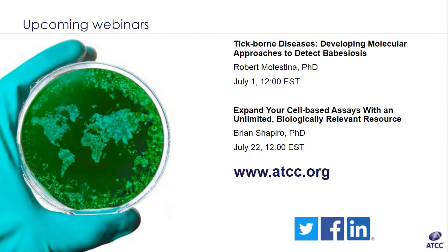There are going to be variations in extraction efficiency. So whatever assay you're working with, you'll have to do an additional set of experiments to figure that out and make sure that you're normalizing your data correctly. But yes, the molecular standards come with an accurate absolute quantitation by ddPCR, so they are a good starting point for those experiments.